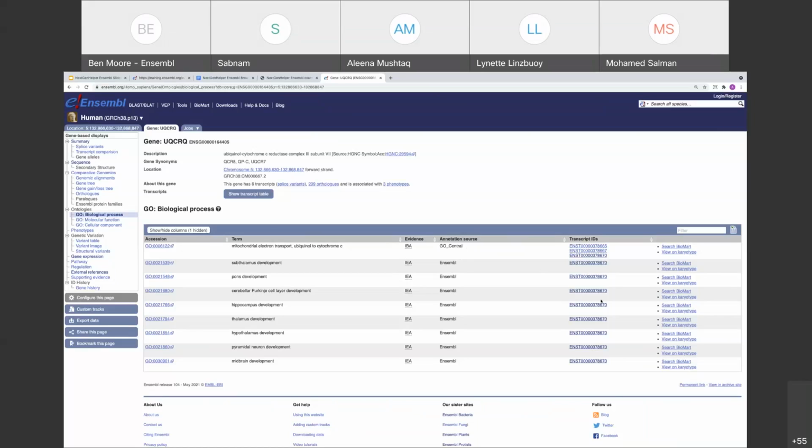So we have transcript IDs, but not gene IDs, and this is because the gene ontology terms are associated with the transcript or proteins. This particular table isn't very large, but sometimes they can get quite massive. So you also have the option to filter this table by this filter section. And you can also export this table by clicking on this Excel sheet here.